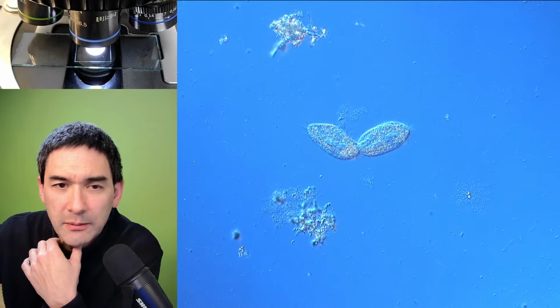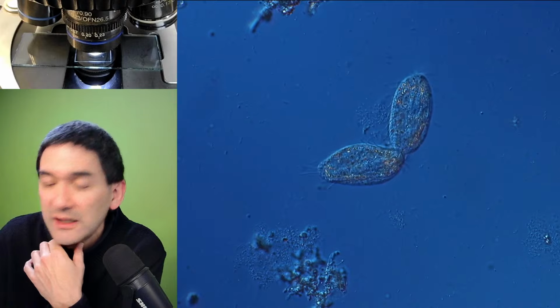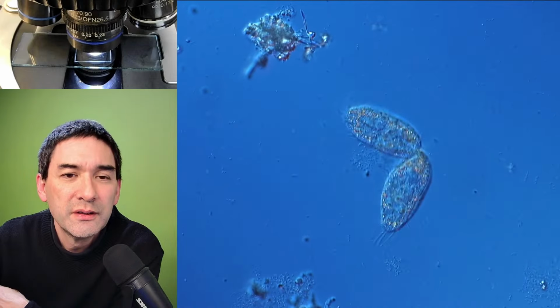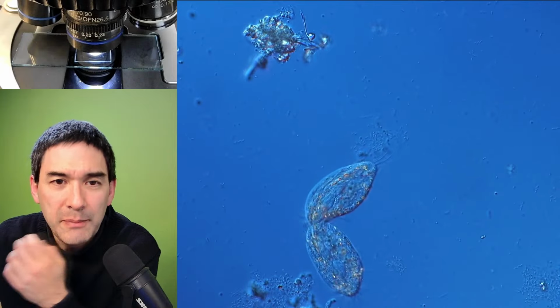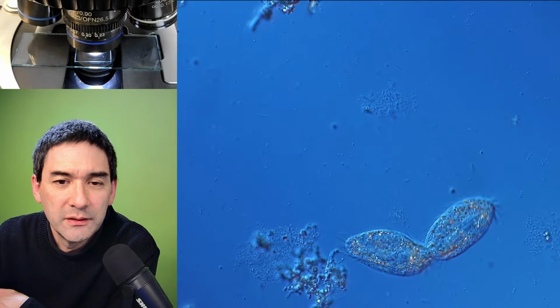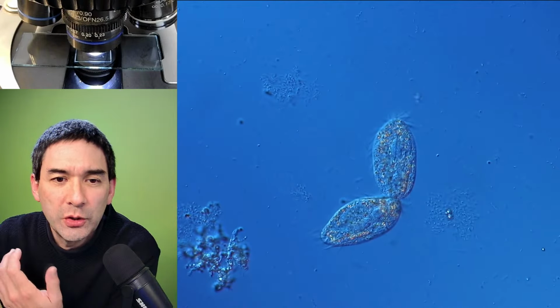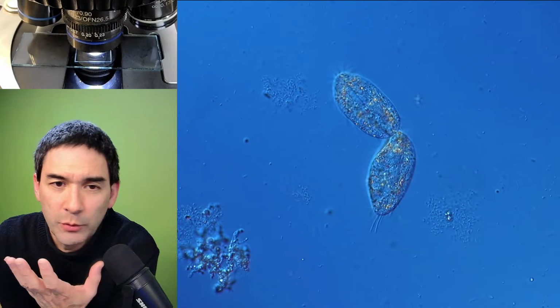Let's see if I'm able to. Let's do it like this. Look at this, you see some parts are actually polarizing there as well. You see those yellow dots in there. And in the background, all of those tiny things that you see are bacteria. So this bacterial soup is actually not ideal, because they take away so much oxygen.